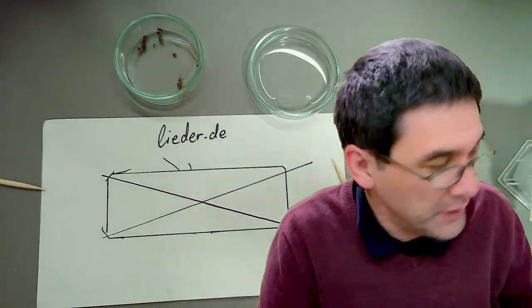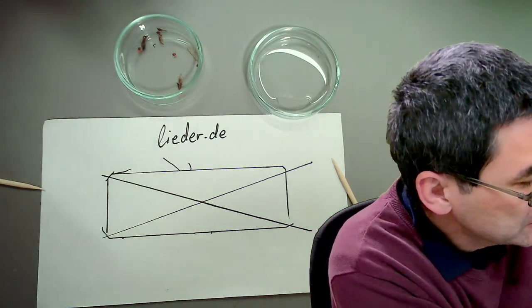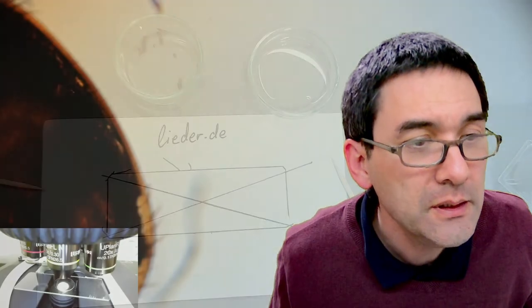Let's see if the first one has somehow changed a little bit. See in the microscope. And no, not a lot. But maybe in a couple of days it might clear up a little bit.